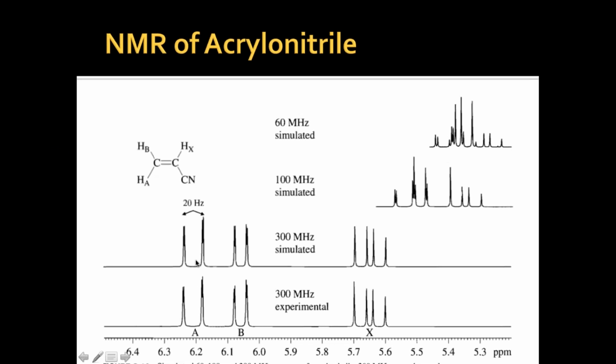So trans coupling means they are far from each other. Now we talk about the B. B is having the cis coupling. Of course, B is in influence of A. So of course it will be a doublet, as I just said, n+1 means the proton has one extra peak. How many protons are in the next carbon? As we discuss some more examples, it will be more clear.